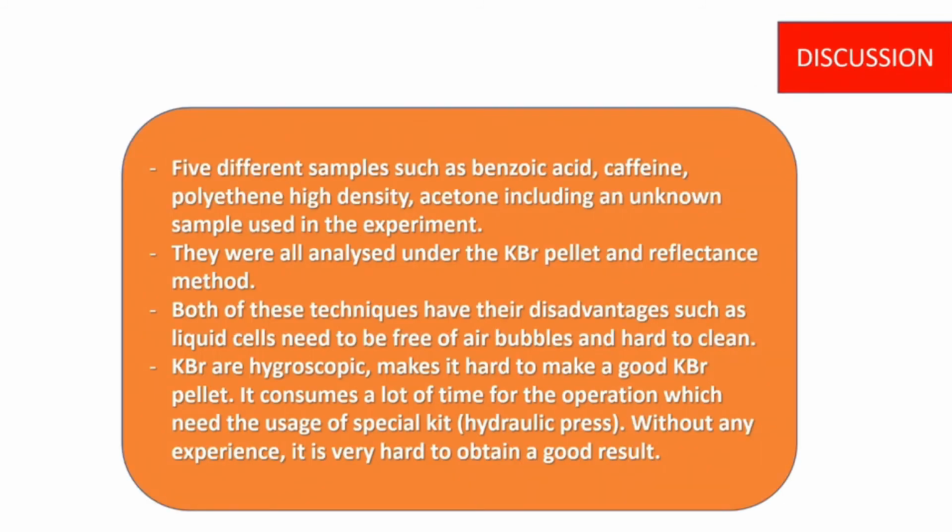Next, in this experiment, 5 different samples were used, which are benzoic acid, caffeine, polyethylene high density, acetone, and an unknown sample provided by the operator.